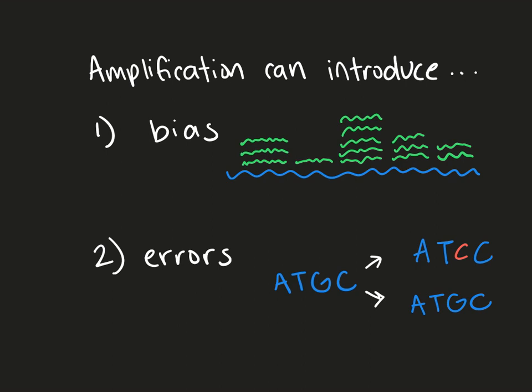During a lot of what we call library preparation, that is getting your DNA ready to be sequenced, we undergo things like cycle checks to make sure that we have amplified our sequence just enough so that we can see the signal, but not too much. Because you can imagine, the more and more you amplify here, you're just going to increase this bias. This one's going to stay low, and this one's going to get really, really high because this is operating on an exponential scale.